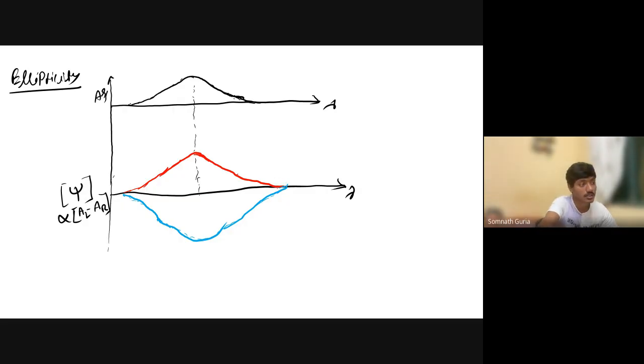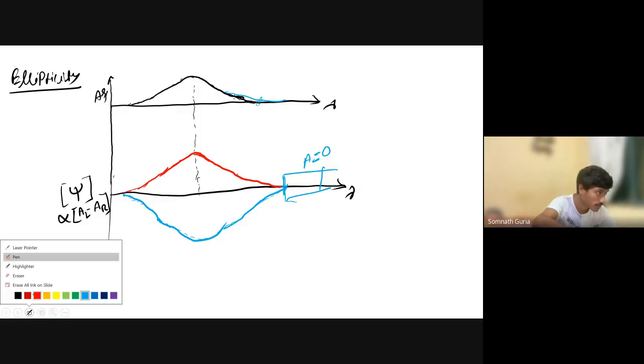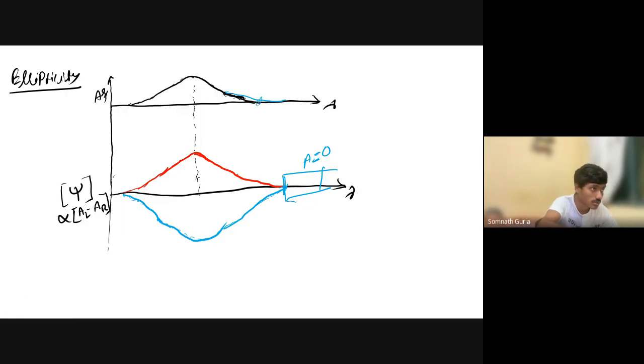And interestingly, there is an absorbance of 0 over here. Absorbance is equal to 0. Why is this so? First of all, in the UV-Vis spectrum there is no absorbance over here. Oh, sorry, this will be also similar. Exactly over here, CD is similar to UV. Only the direction will be different for one particular enantiomer. So their absorbance is 0 because the molecule is not absorbing in that particular region.